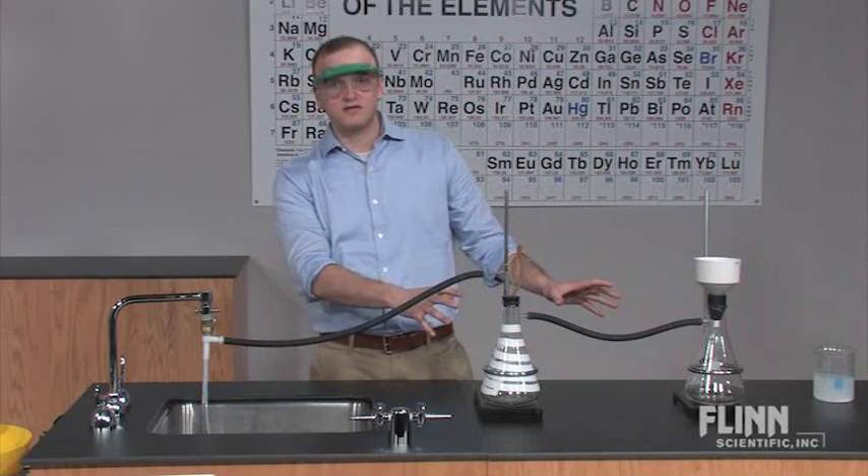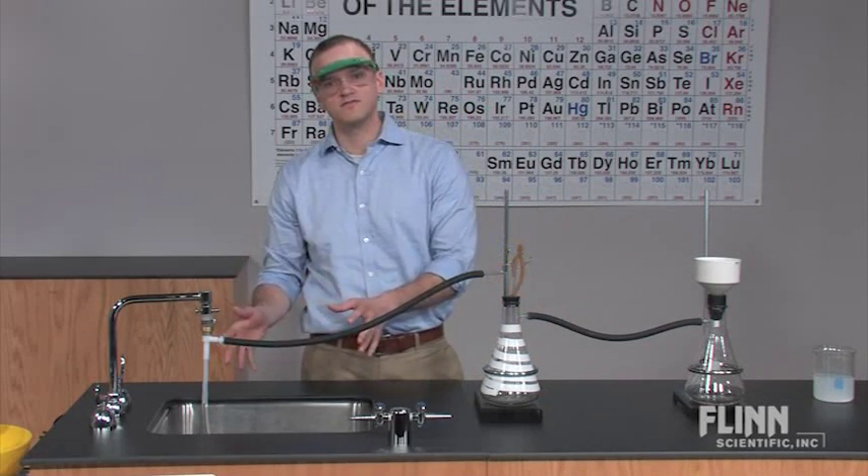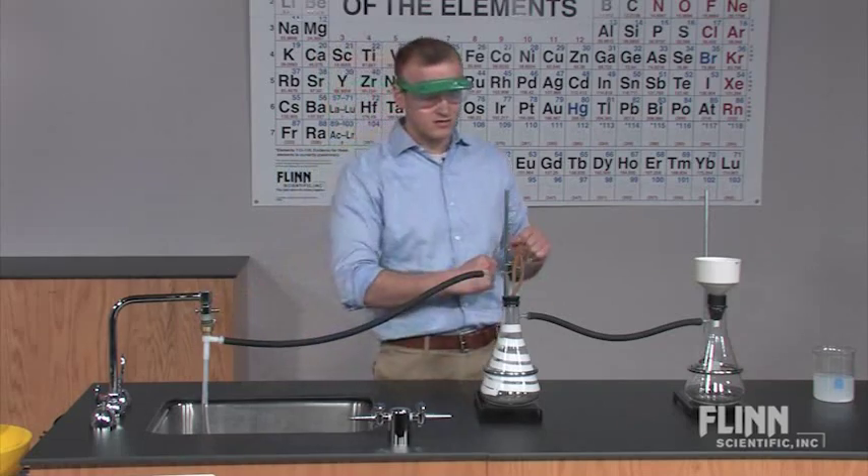Once you've checked all seals and everything is connected well, you're ready to go. You can turn the water on and start that partial vacuum.